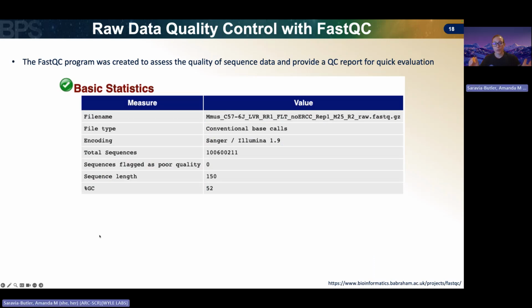And so, of course, reading all of those quality scores and having to map that back from the ASCII encoding to the Q score, and then looking at it for a length of 100 plus bases, for these FASTQ files can contain millions of reads. It's pretty impossible to be able to assess quality looking at these things one at a time, which is why this FASTQC program is so great. It's one of the most common ones used to assess the quality of sequencing data. I know we went through this in the GL4U intro module set, but we're going to review it again here.